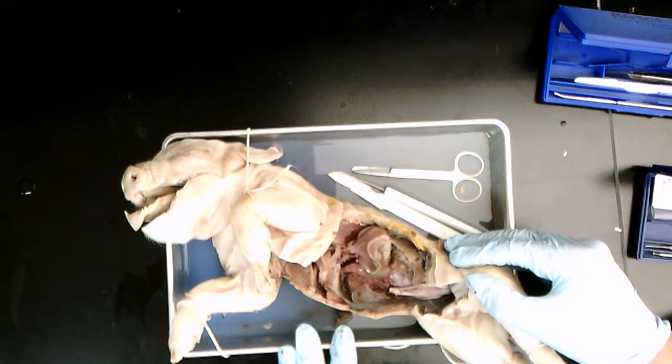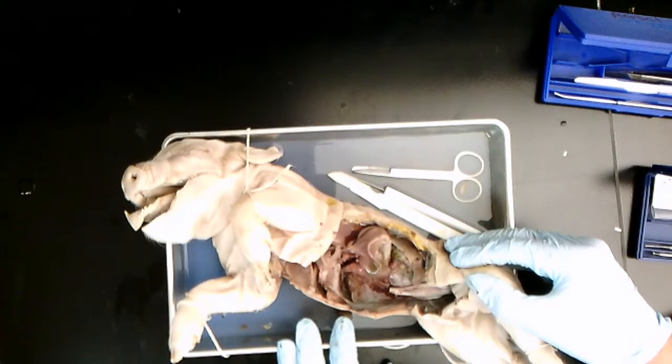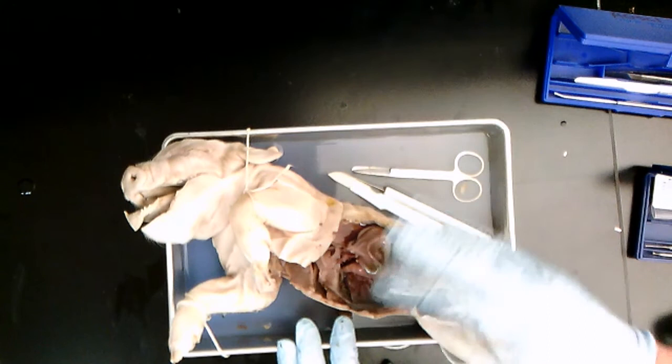When I would do this, it would typically last a week, and one day would be the mouth, and we'd get really in depth with that. The next day would be the chest cavity, and then we might spend a couple days on the abdomen. I would demonstrate with a document camera like this, and then the students would go ahead and do it. It was very methodical, and you could go further than that.